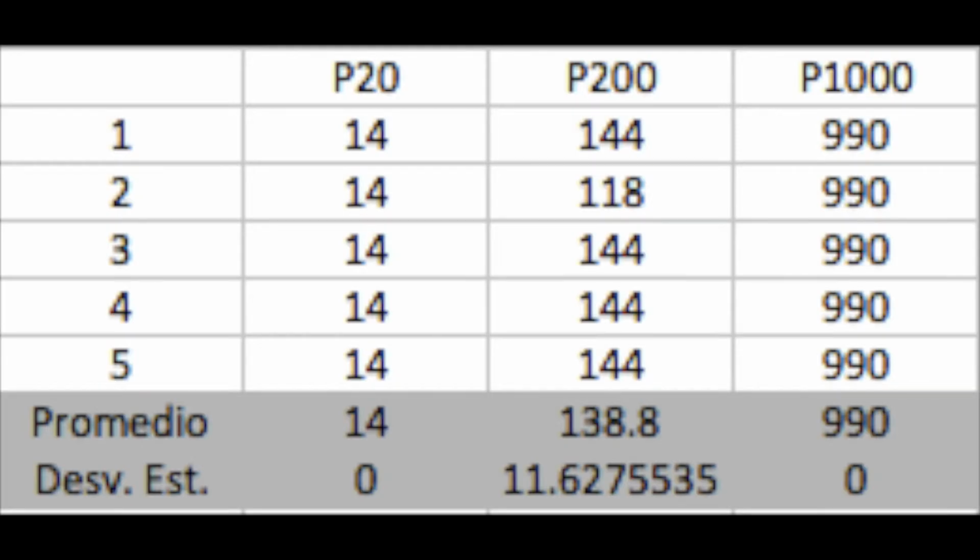In the activity of pipetting by parts and then gathering all the accumulated volume using pipettes of 20 and 1000 microliters, exact values were obtained in 5 attempts. However, when using the 200 microliters pipette, an error was obtained. The standard deviation of the first two cases mentioned was 0, having no errors, but the second had a standard deviation indicating that there was some dispersion in data collection.